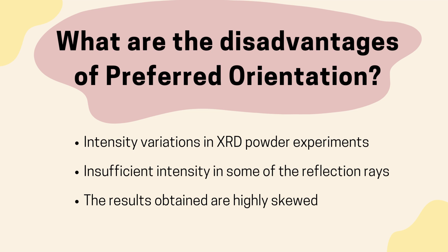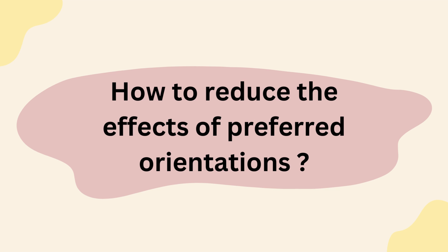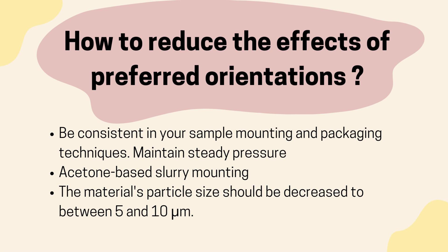What are the disadvantages of preferred orientation? The disadvantages are: intensity variations in XRD powder experiments, insufficient intensity in some of the reflection rays, and lastly the results obtained are highly skewed. To reduce the effects of preferred orientation, we need to be consistent in the sample mounting and packaging techniques by maintaining steady pressure. Next, use acetone-based slurry mounting, and lastly the material's particle size should be decreased to between 5 and 10 micrometers.